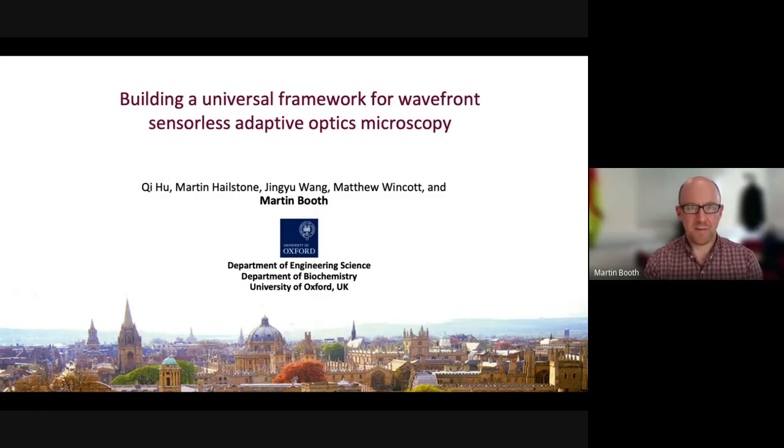So yes, the presentation today is based upon our long work in the area of adaptive optics microscopy. What we're actually trying to do here is come up with something for what's happened over the last 10, 20 years, where many people have been working in the area of trying to implement adaptive optics in microscopes with many areas of success. But until now, we don't have a universal solution to this. There are many, many different ways of doing adaptive optics in microscopes, and no single one of them has solved all of the problems.